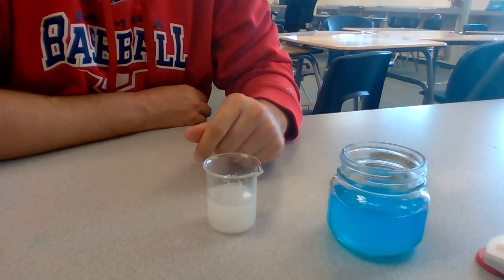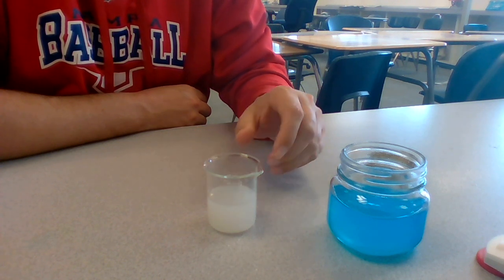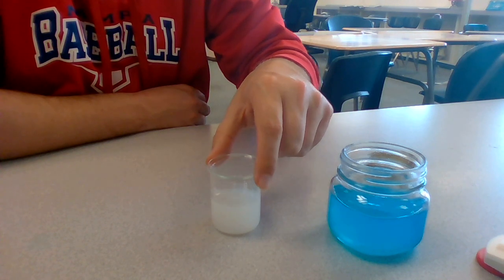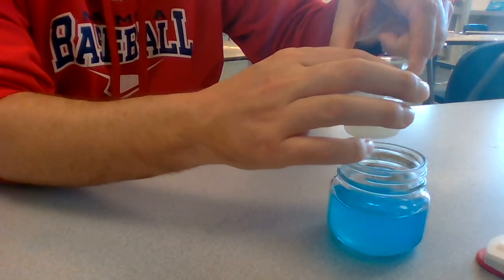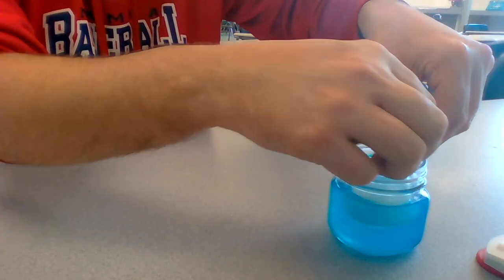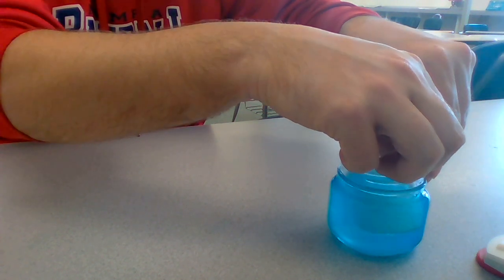All right, in the instructions, it says to place the silver nitrate into the copper chloride without spilling any, so I'm going to go ahead and try to do that right now. So I'm going to place this gently inside here without any of it spilling, hopefully.